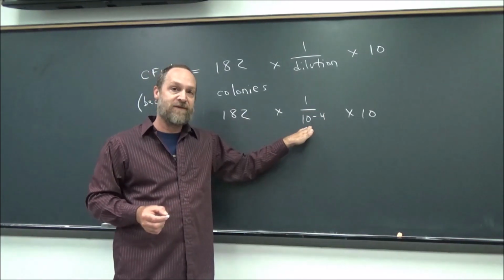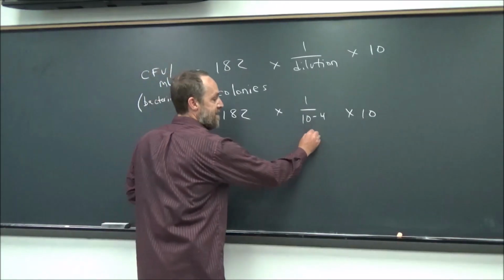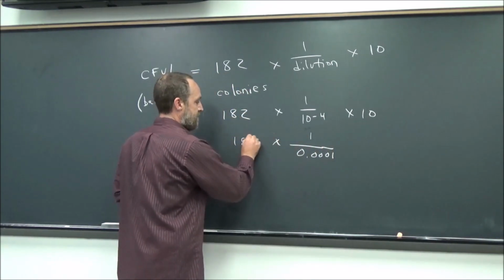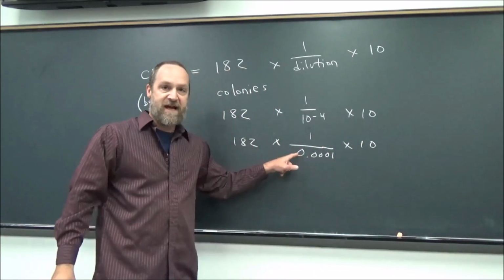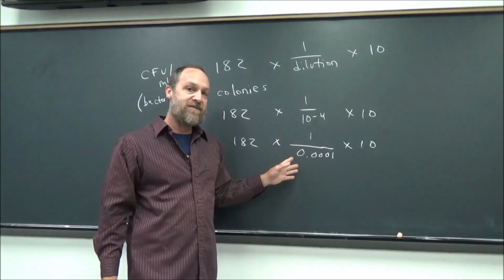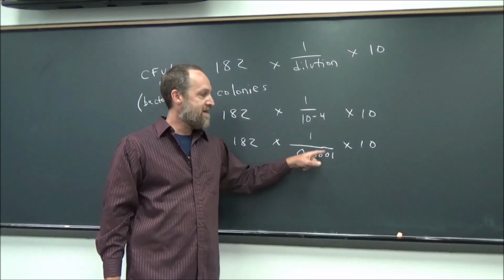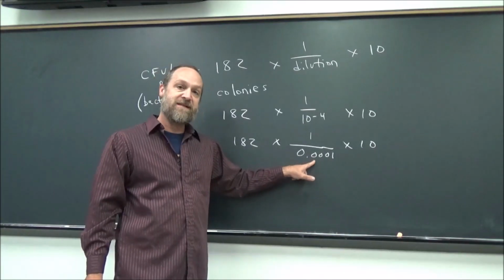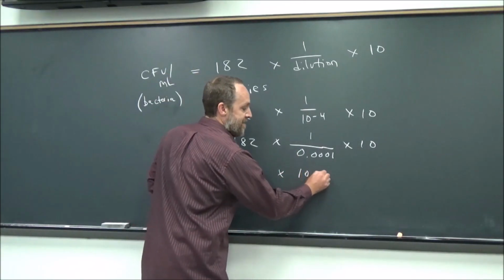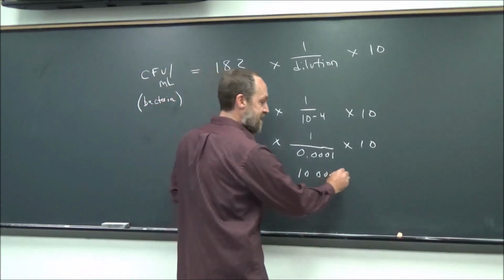Okay, now this can be a difficult calculation for some people. What I like to do is convert the exponent into a decimal. So that is 0.0001. Okay, I've got in the handout how to convert negative exponents into decimals. So now that we have this, we can say 182 times 1 over 0.0001 times 10. But look, you can also convert this into a single digit. Basically, look it up in the PDF handout. This would be equal to 10,000. Okay, so we have 182 times 10,000 times 10.